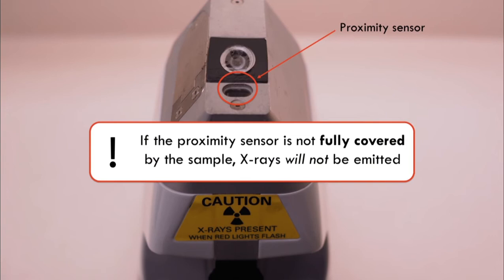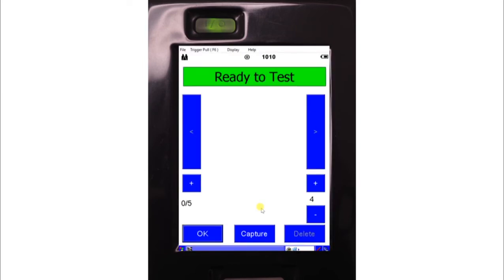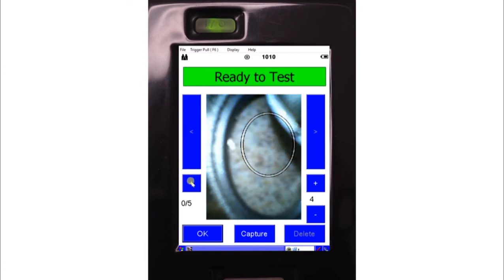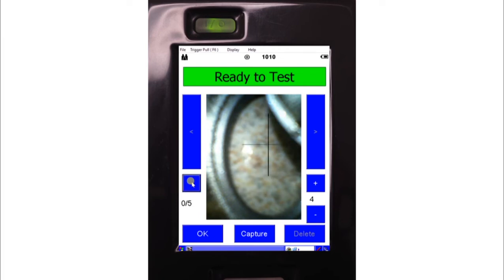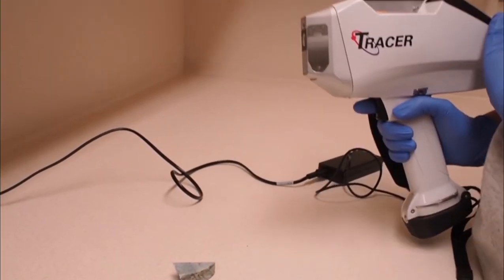If you wish to capture an image of the area analysed, click on camera on the main screen and the capture button before analysis. The camera is also a good tool for positioning the analysis window on the area of interest. Remove the spectrometer from the sample after analysis is complete.